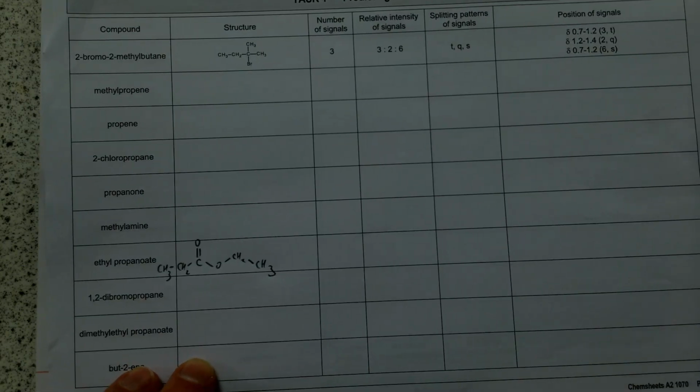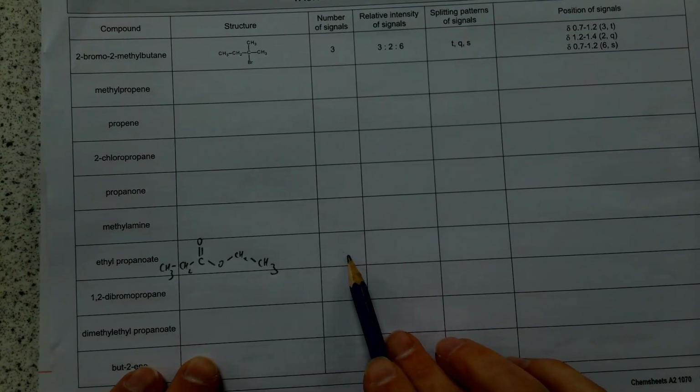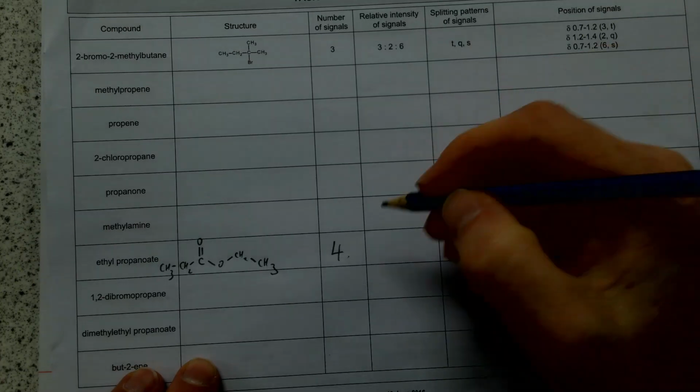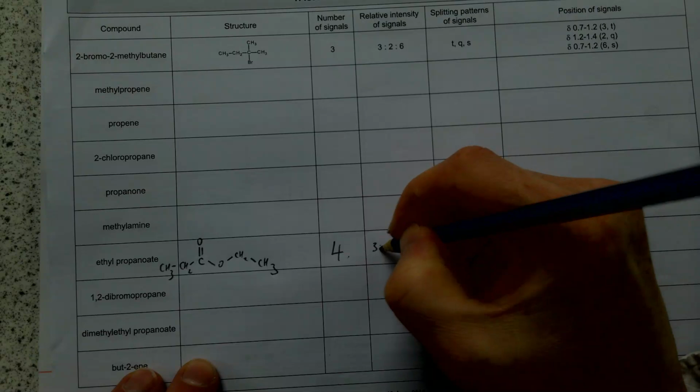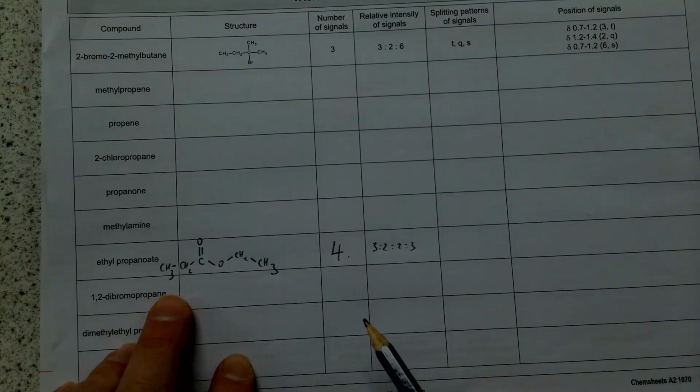The number of signals is the first thing, it's the number of peaks. So show me with fingers how many peaks you think there are. And the intensity of each of those? 3, 2, 2, 3. And then the splitting patterns for those would be, starting on the left, please.